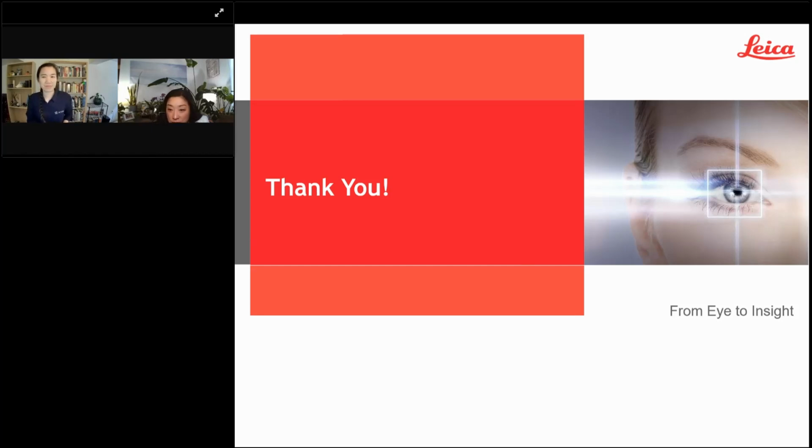The first question is, can you measure the distance between objects in time-lapse images? Yes, so the object relationship tool, the distance measurements we were looking at and things like that also work for 4D time-lapse images. So that is possible in those kinds of data sets.